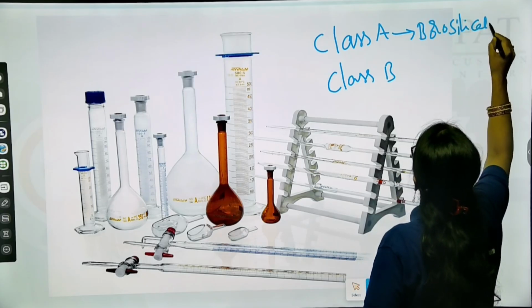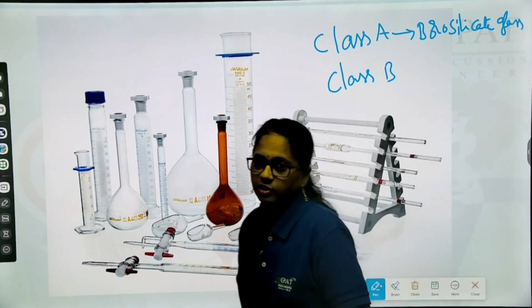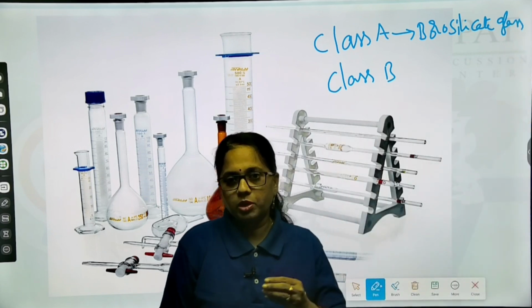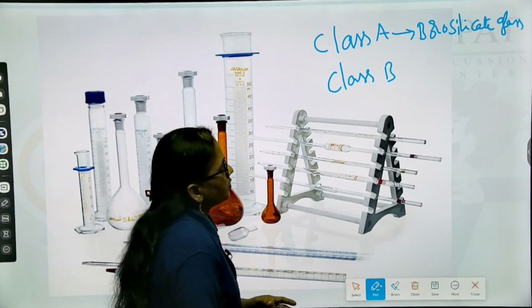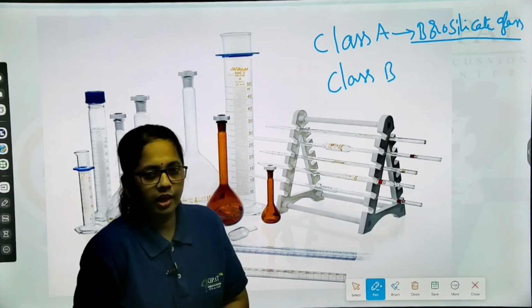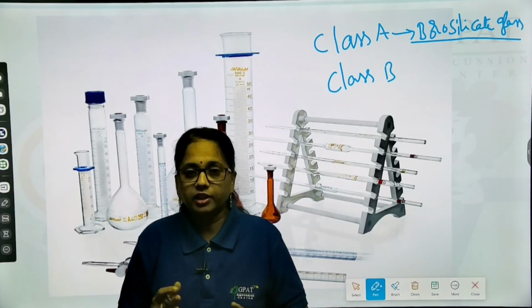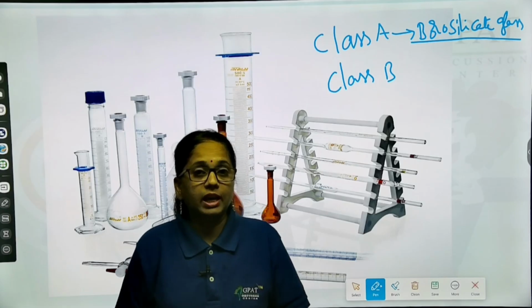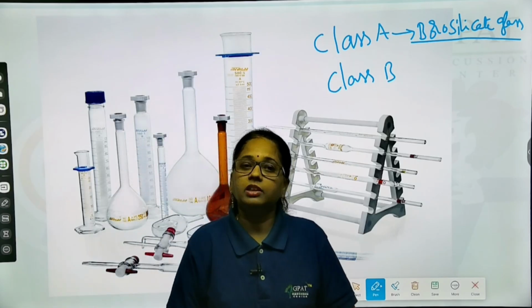Okay, borosilicate glass means it is highly resistant towards the chemicals we are going to use in the pharmaceutical laboratory, and under certain conditions thermal expansion is also one of the major problems for the glassware.